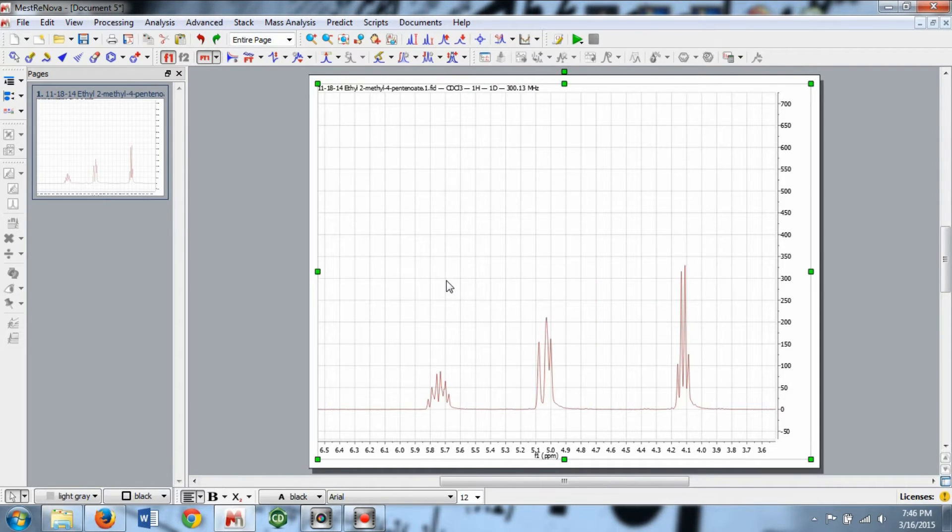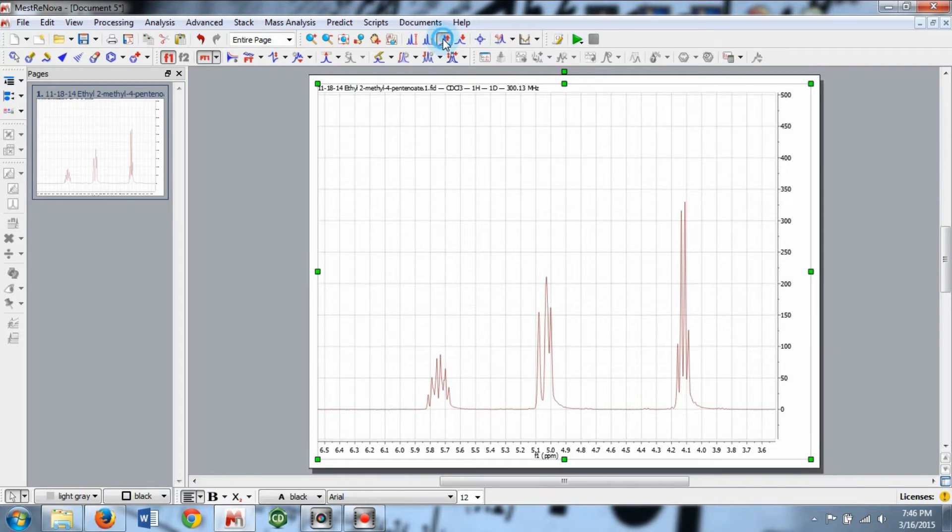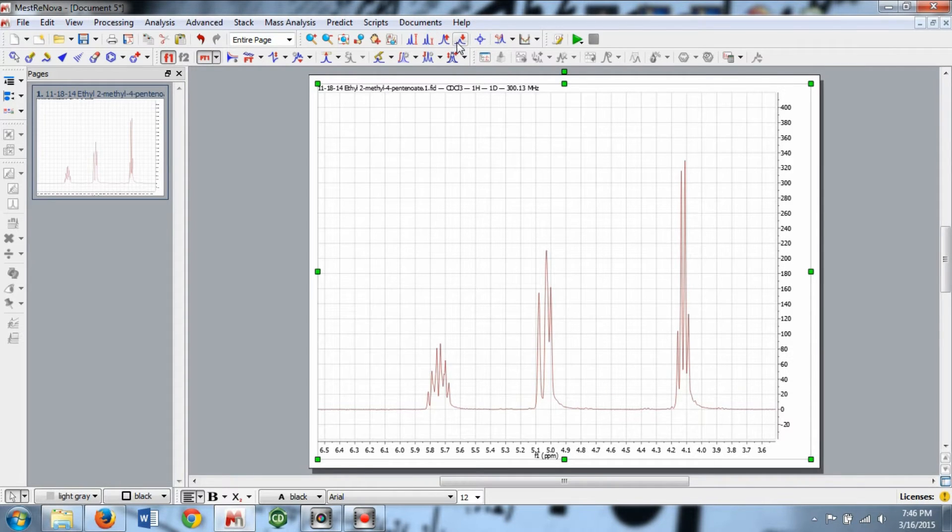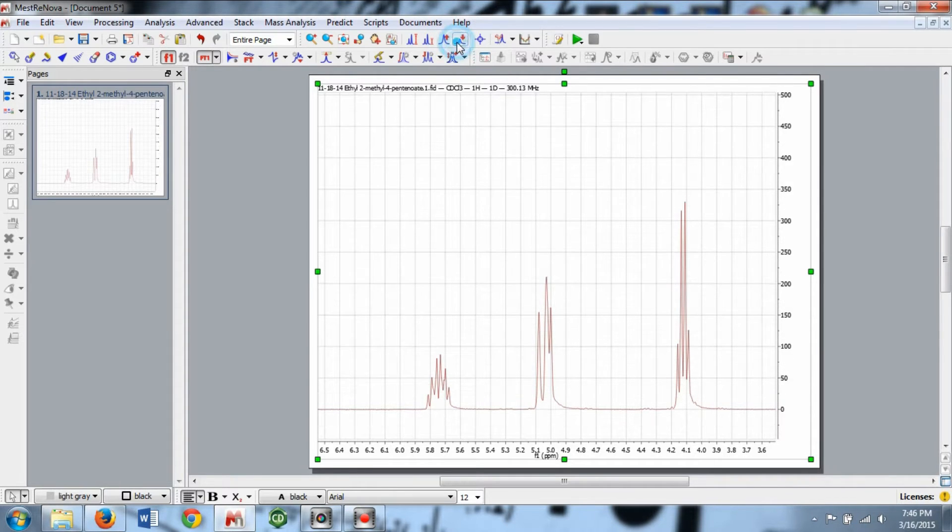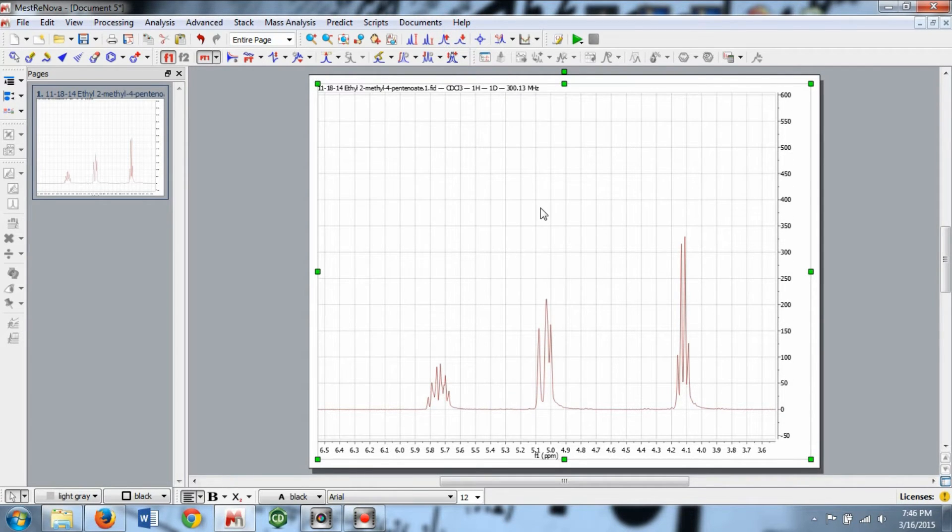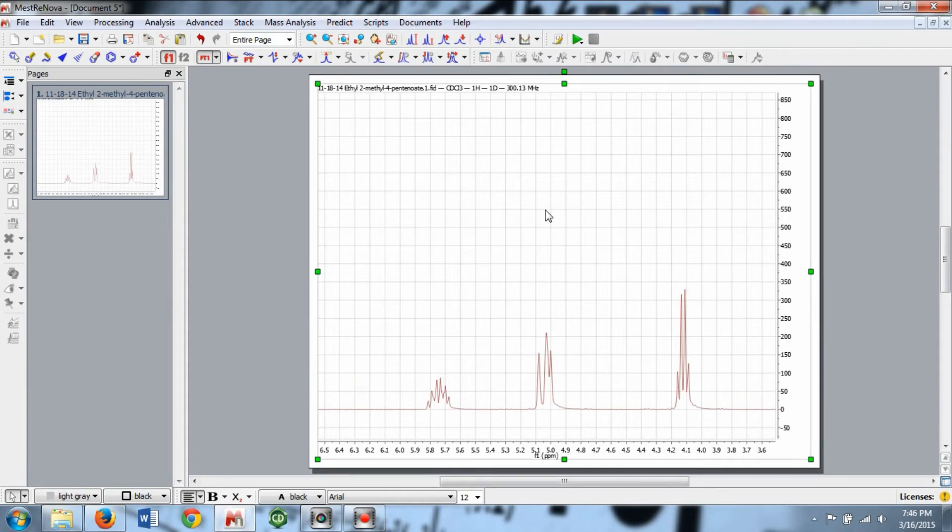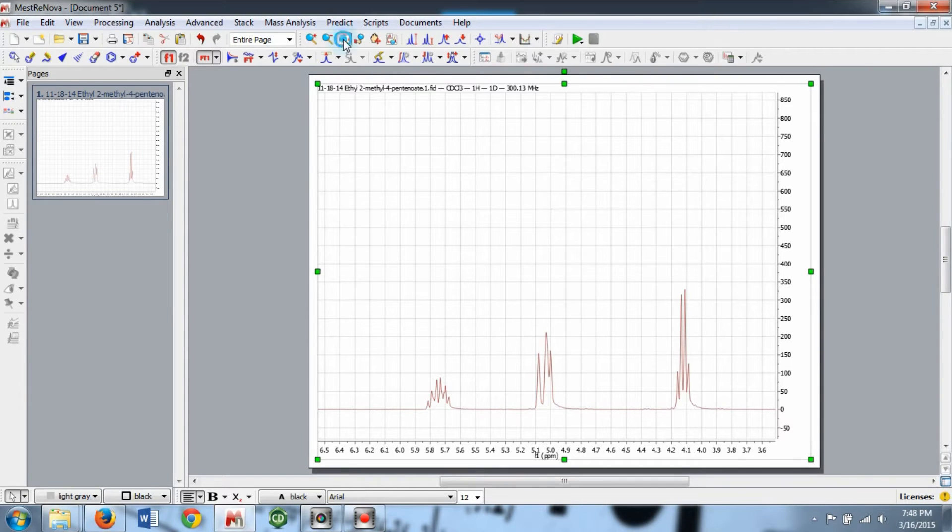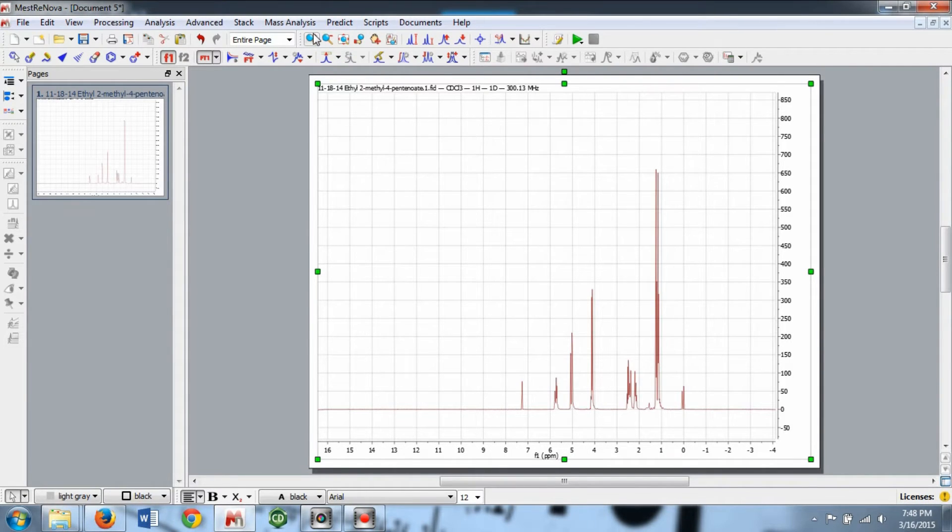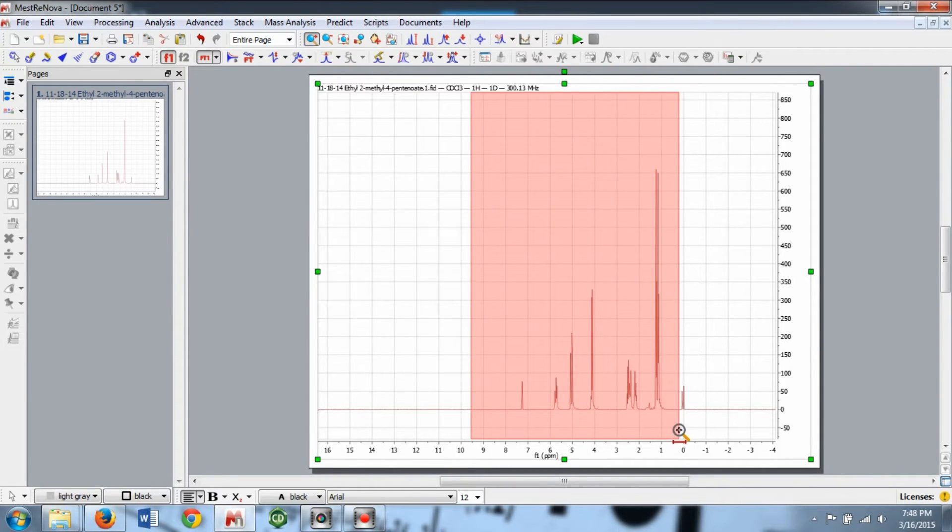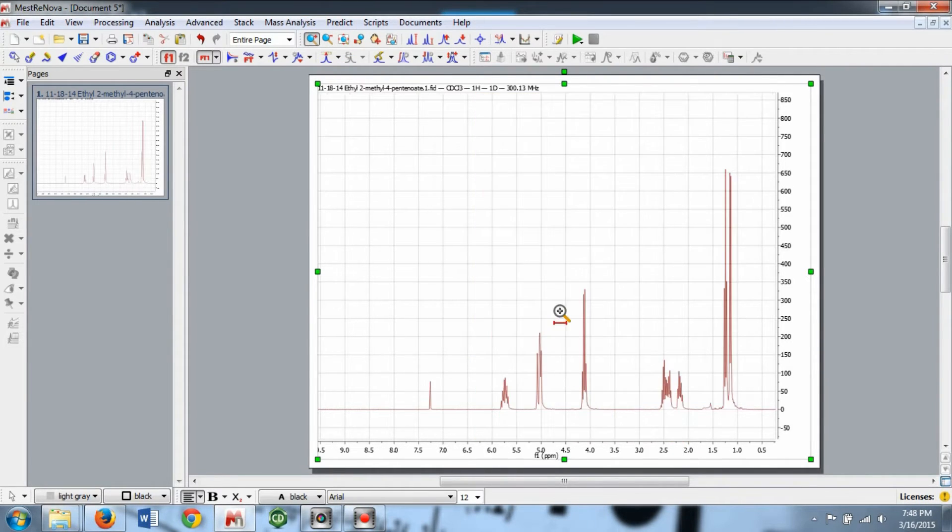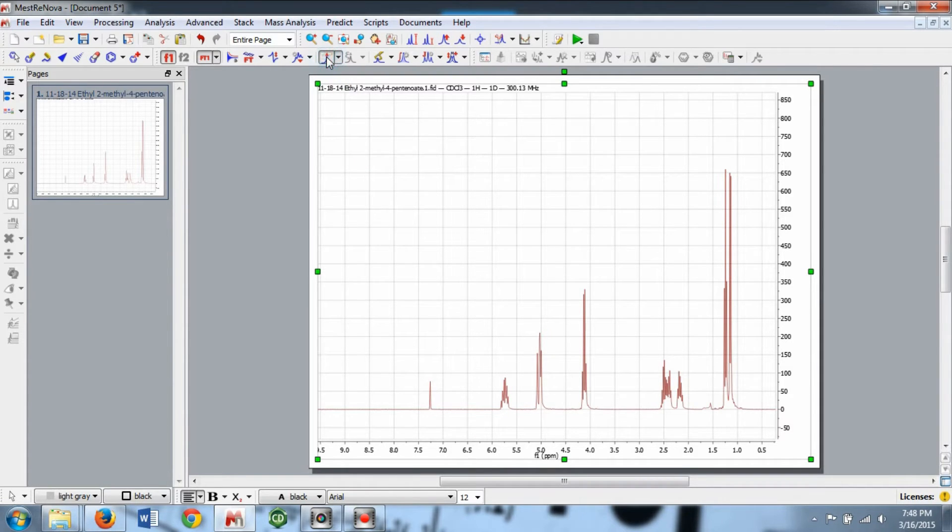If your peaks need resizing, you can change the Y-axis by clicking the increase or decrease buttons in the toolbar or by using the scroll wheel on your mouse. Now we can start analyzing our data. The first thing you want to do is set a reference peak.